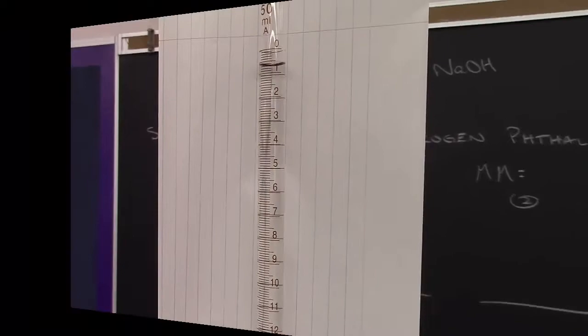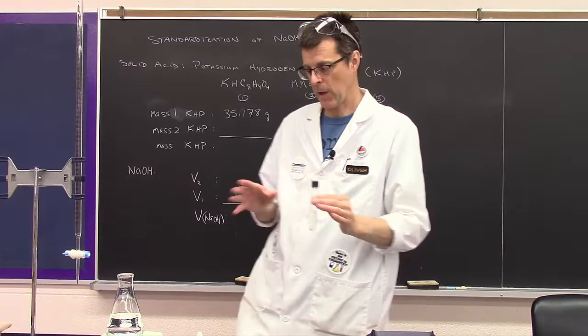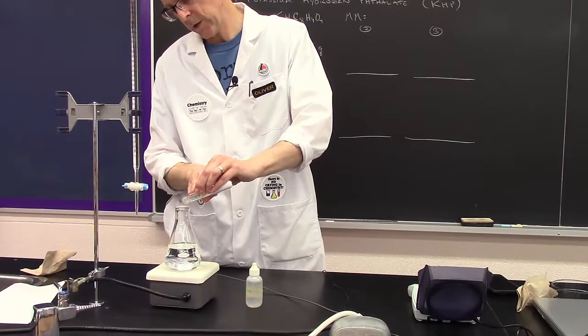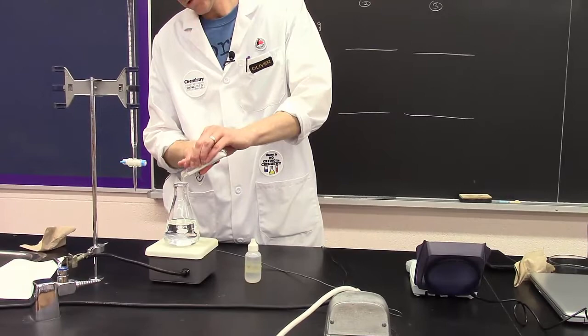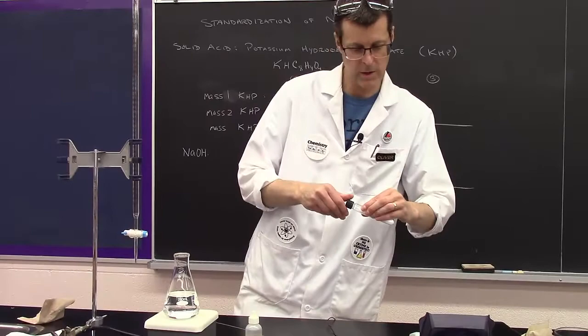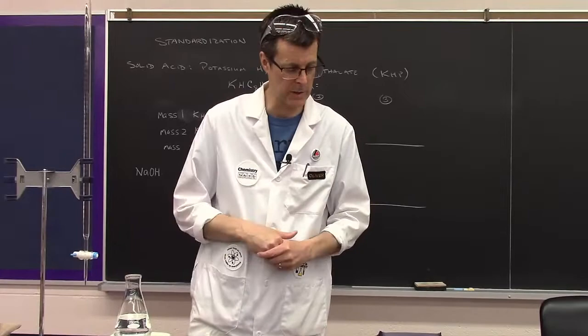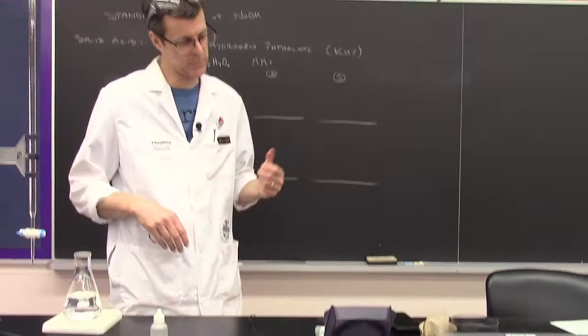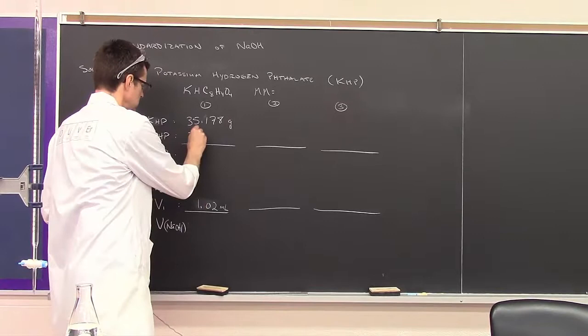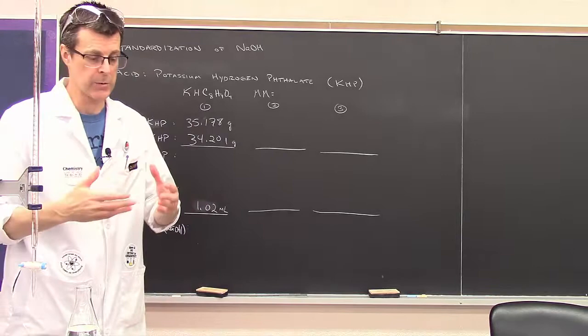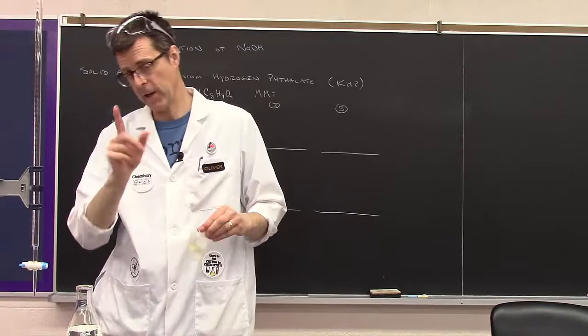I've taken my first mass of solid acid on the balance, and now I'm going to put some in. It doesn't matter really how much I put in. I don't want so much that it won't all dissolve, but I need enough that I can measure my base properly with the reaction. Then I'll put it back on the balance and find the second mass, which is 34.201. By subtracting those two numbers, I'll know how much acid I added to the flask.